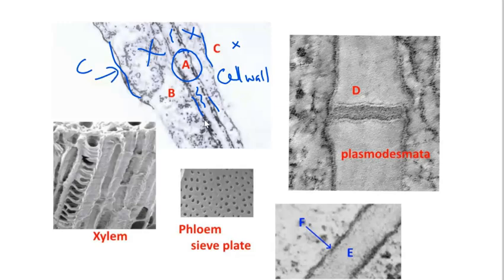These are the membranes of the vacuole, which are known as tonoplasts. But the main feature I wanted to look at was that of the cellulose cell wall. We come across the cell wall in a number of parts on the course, very particularly when we're looking at xylem structure in plants, known for their conduction of water and minerals. The cellulose cell wall also forms things like the phloem sieve plates shown here, showing the pores in the end walls of the phloem tissue.